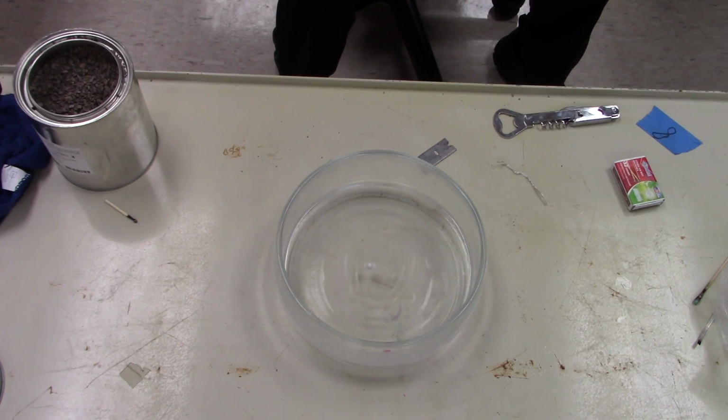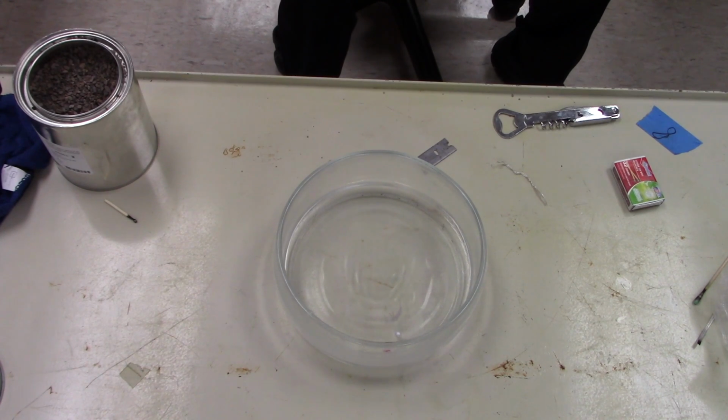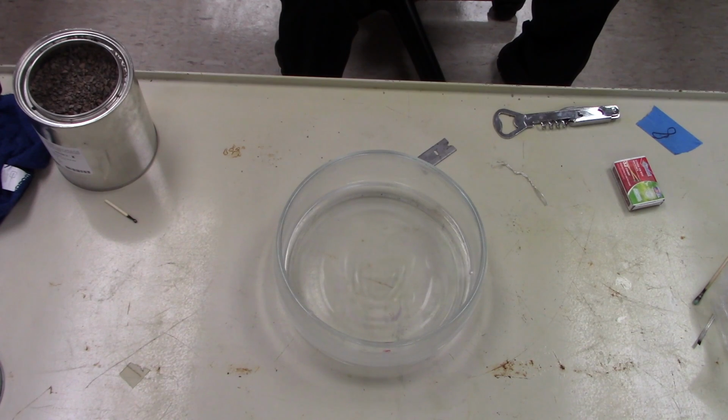But this shouldn't because, well, it did on me one time last year, but this one won't. But sometimes, yeah, while it's sitting in the water, it catches fire. If you go on YouTube, you can watch videos of people doing this kind of thing. If you take something like cesium and do this, if I would have put that much cesium into this, the entire thing would have exploded just right away. Like every one of us probably would have had glass in our faces or something like that.